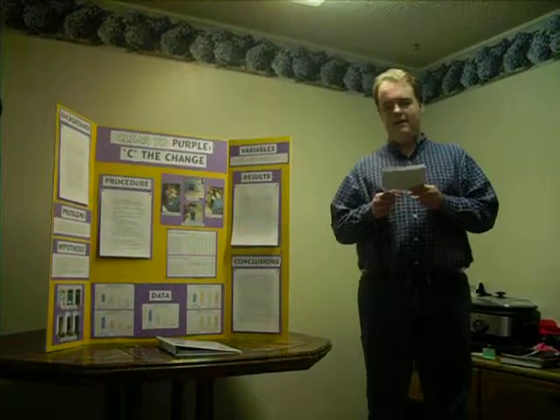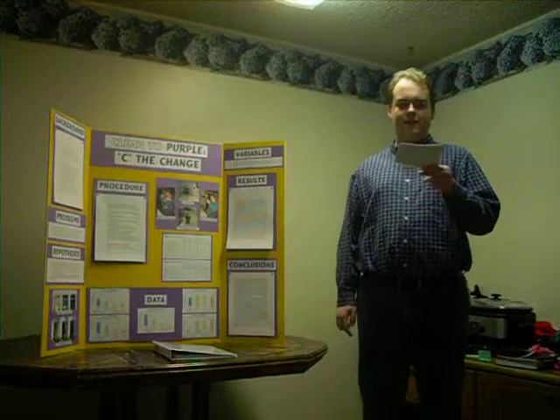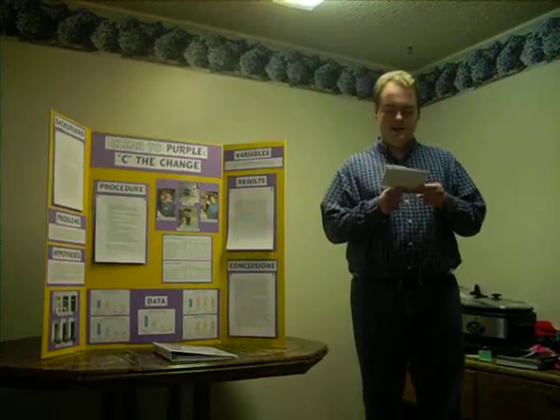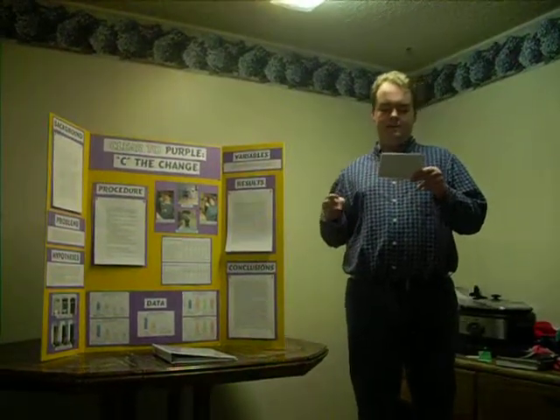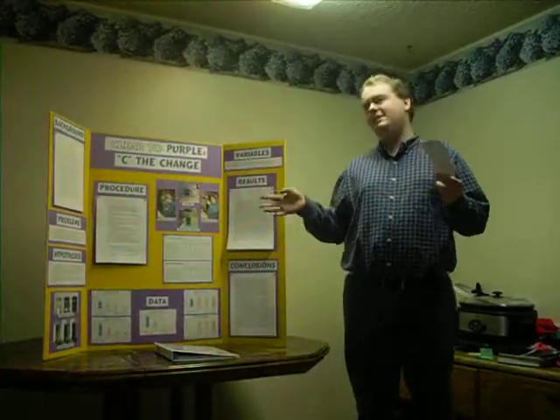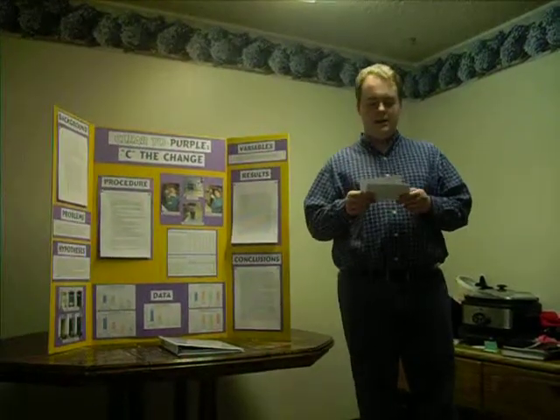For the second problem, which is the one with the Briggs-Rauscher reaction, I hypothesized that heating the reaction would speed up the oscillations, but that adding hydrogen peroxide would not significantly speed up the oscillations. For it is primarily the sustaining reaction. It doesn't have much to do with how fast it goes.